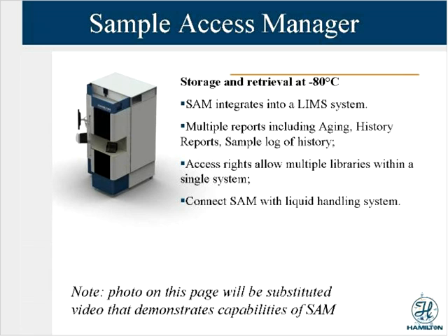It's completely robotically controlled. It allows us to integrate the system with our laboratory information management system and also allows us to do all sorts of reporting and tracking the history of different samples. And importantly, for the type of samples that we're working with, allows us to provide security measures in terms of access rights to different samples within the system.